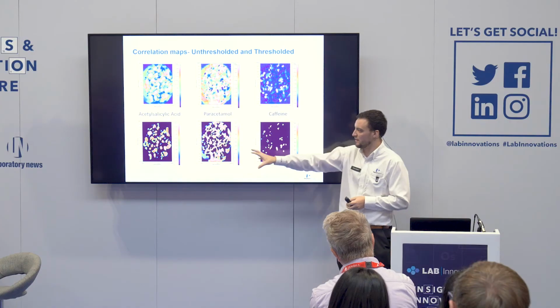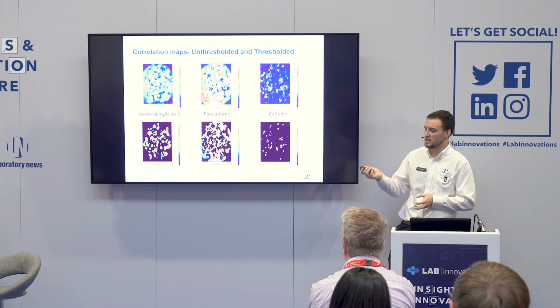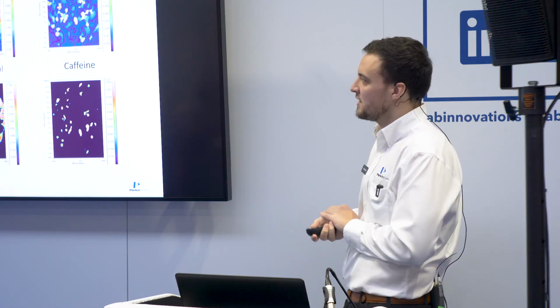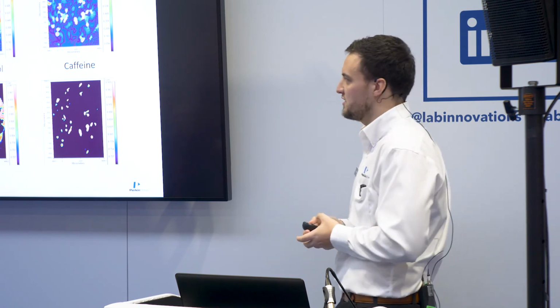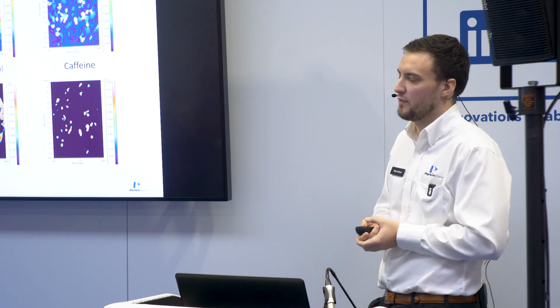And again, if you were really good at puzzles and you could put those three images together, then you would be able to see how it all molds into one tablet. So that is the reference spectra. So that's using if you know the materials and you know your APIs that are involved.